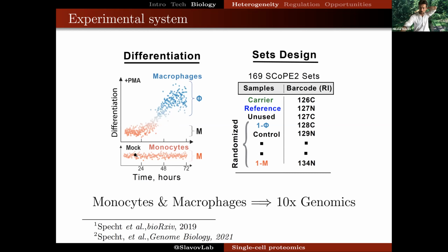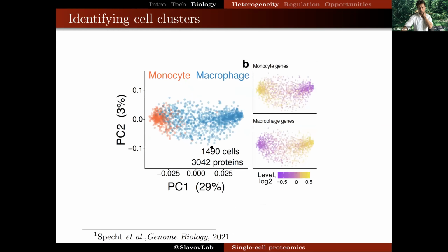So we took cells from the same culture of differentiating monocytes, keeping track of each cell, whether that's a monocyte or macrophage, and analyzed them either by single cell mass spectrometry, or by 10x Genomics. And the first thing is the very low bar. What happens if we just project the data into their principal component axis? And here with the protein data, we did that without filtering any proteins, using all roughly 3,000 quantified proteins across multiple single cells so that they can be usefully analyzed.